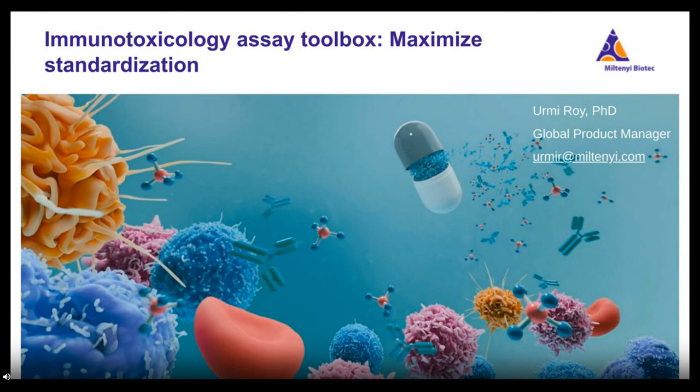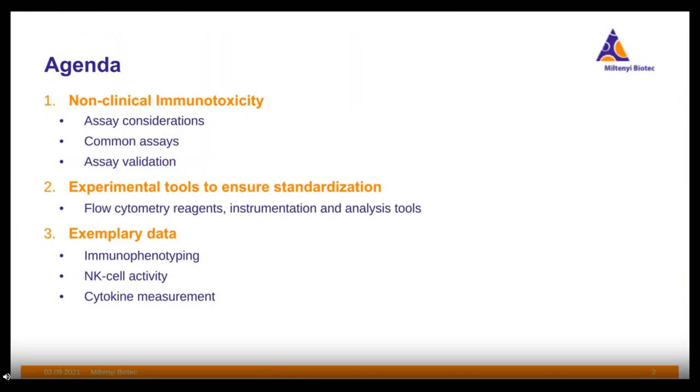Today I will discuss immunotoxicology, one of the very important segments within drug development. In today's presentation, as an introduction, I will discuss immunotoxicity, mainly different assay considerations, common assays, and extensive validation of those assays that are proposed by regulatory authorities.